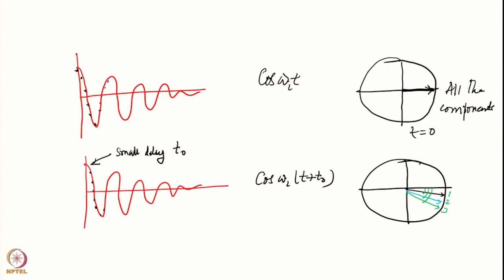Compared to the previous one, which was a zero order phase, now because of the delay in the data acquisition, the different frequency components in your magnetization have moved to different extents. Therefore the first line would have a mixture something like this, let me call this 1, and the second one may have some more here, and the third one would have even more, and so on.